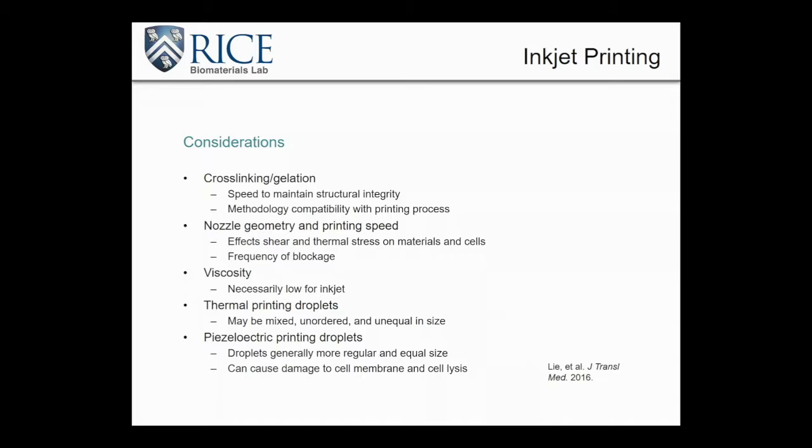The nozzle geometry and printing speed of inkjet printing also drastically affect not just the resolution and the gelation of our scaffolds, but also the thermal and shear stress on materials and cells. So we'll see some research that actually investigates nozzle geometry and printing speed. And these also affect, uniquely in inkjet heads, problems with blockage of those heads, which of course can ruin prints really easily and are very annoying.